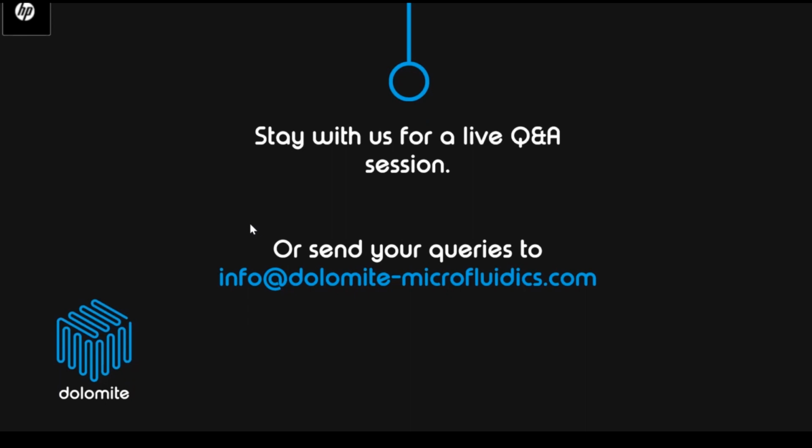So is it possible to achieve synthesis of liposomes and lipid nanoparticles using the same chip, materials and settings? If so, what discriminates the formation of the first instead of the second? So usually it is any of those formulation variables that can affect how the self-assembly occurs, as well as the way we mix the two fluids. The only way of really determining whether you're making liposomes or lipid nanoparticles is to do some image analysis, whether you're using a TEM, SEM, that way you would be able to determine whether you're making one or the other.